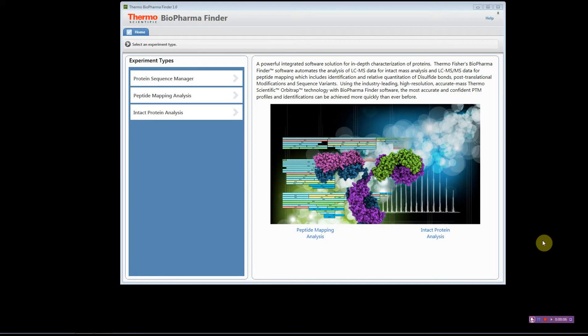Welcome to the BioPharma Finder how-to videos. In this video I'm going to show you how to load a new protein sequence to the software. Open the software — on the home page you'll see an option called Protein Sequence Manager.